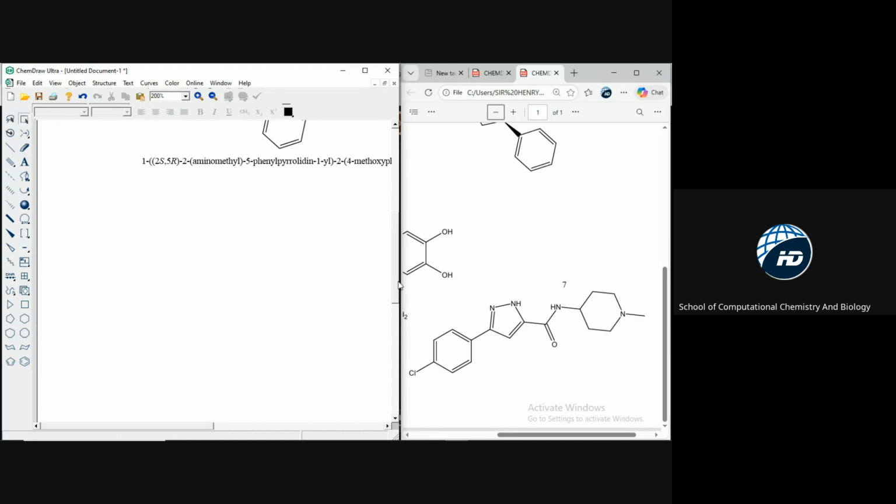So you now see that drawing of structures is not difficult. You can draw more than 50 structures or 100 in 1 hour because it's very flexible.